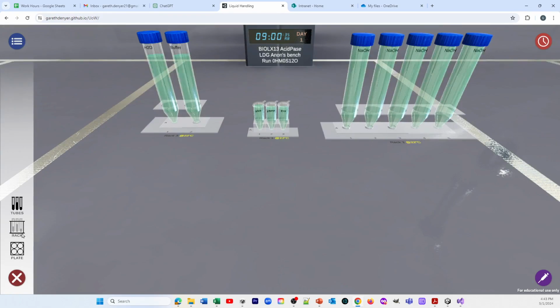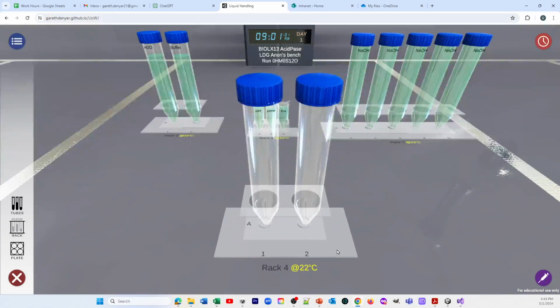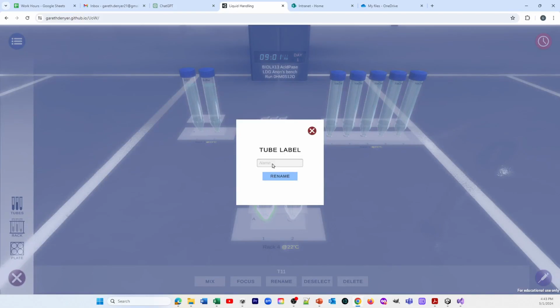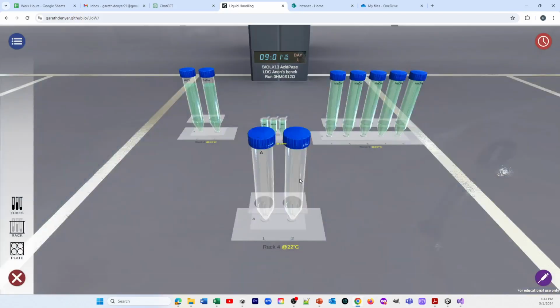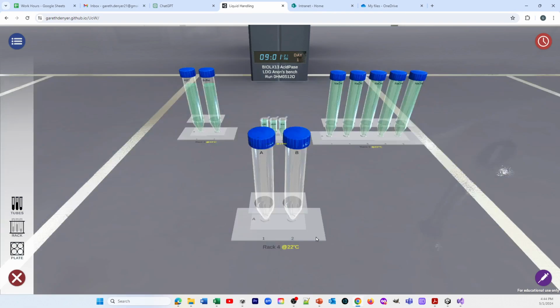Now, the way that this experiment's going to work is we're going to set up an incubation of the substrate, pNPP, with the enzyme, and that enzyme is just going to be diluted in the appropriate buffer, as is the pNPP. So we're actually going to set up two large tubes. So we create two slots, say that we want the large tubes, and there are going to be two of them. And here they are. And just as before, it's quite convenient. I'm actually going to label these tubes. So I'm going to click on them, click rename, and I'm going to call this one tube A. And I'm going to call this one tube B, exactly as we're going to do in the practical class.